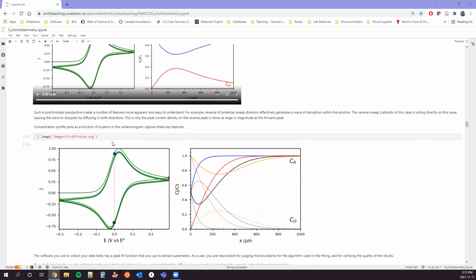And they'll eventually hit the point that you've got a flat front that's going outwards. And so that then introduces exactly the same situation as this. Okay, so it depends. Again, time frames and scales of what you're working with.